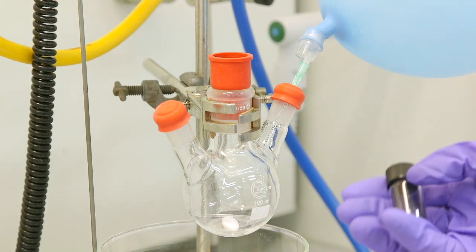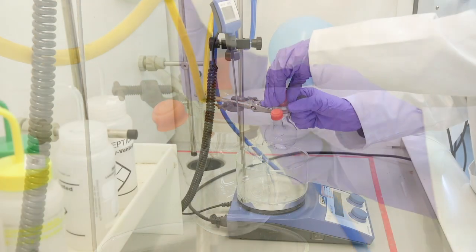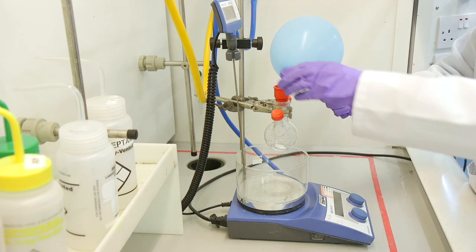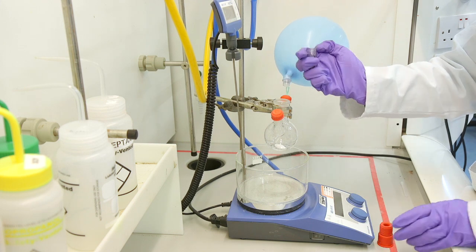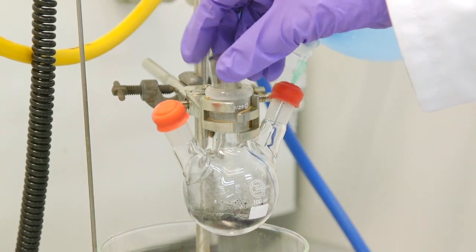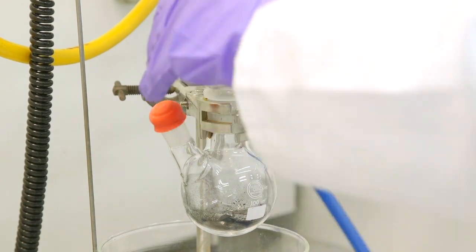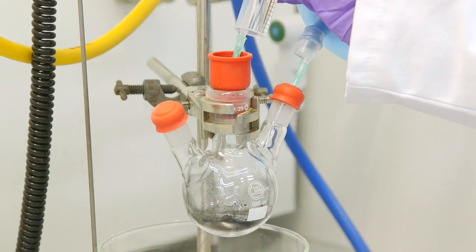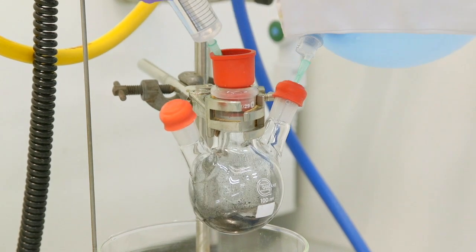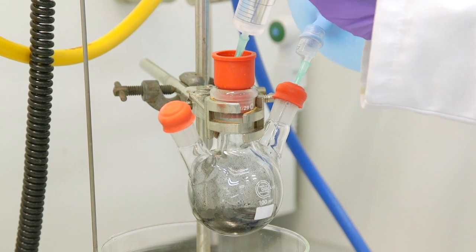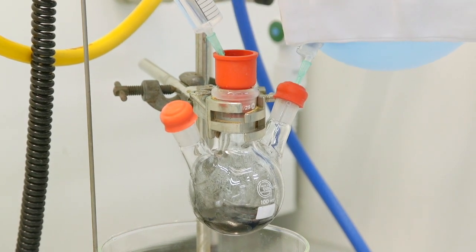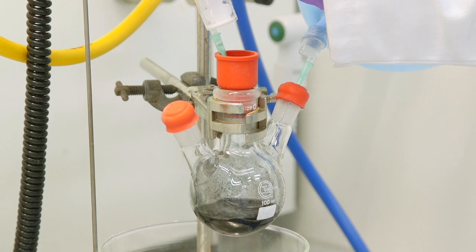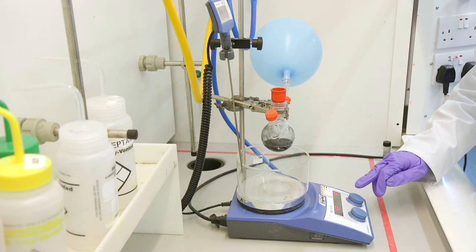We will now add our palladium catalyst through one of the necks to the flask. This is then followed by washing the neck of the flask with our reaction solvent which in this case is ethanol. We can now begin stirring the reaction.